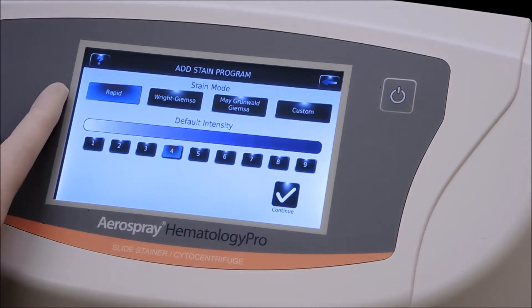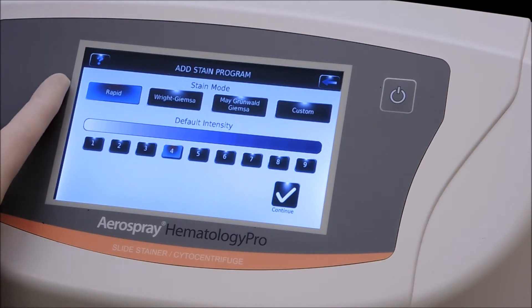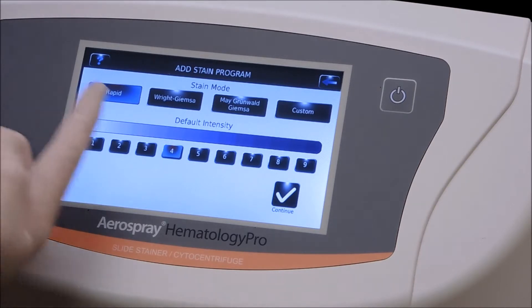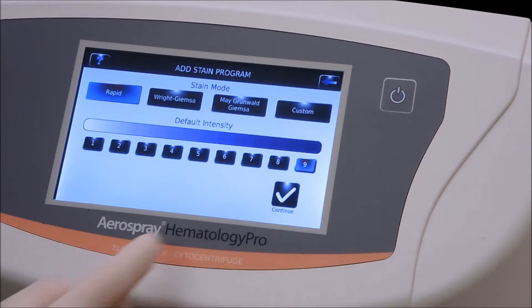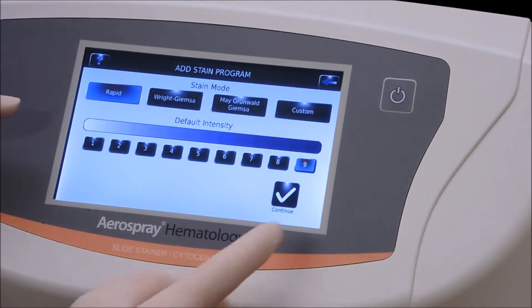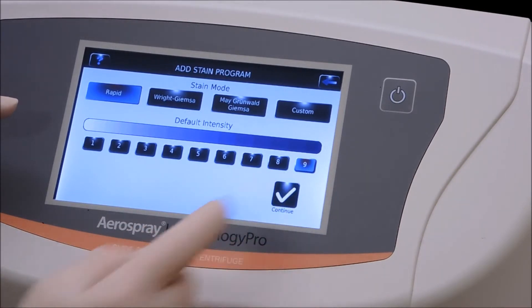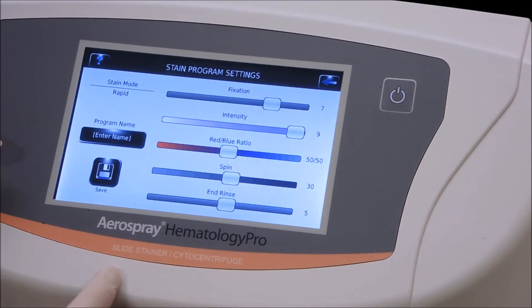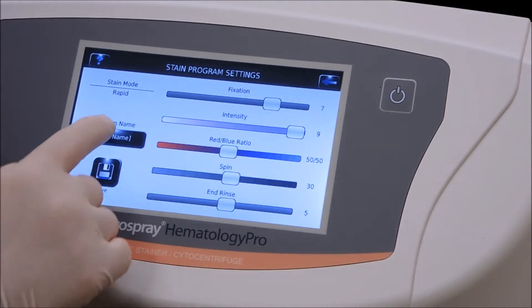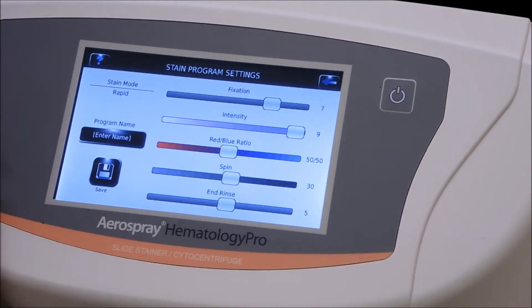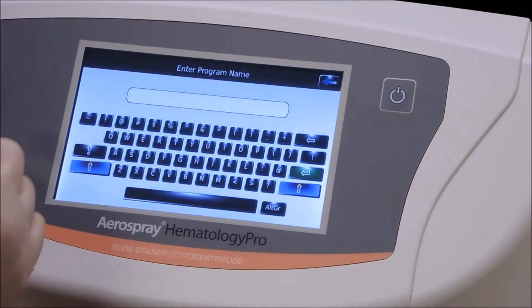We're going to do the rapid number nine program to help exercise those valves. You can see the first one is highlighted — we want number nine to be highlighted. Once you've done that, push the continue button.